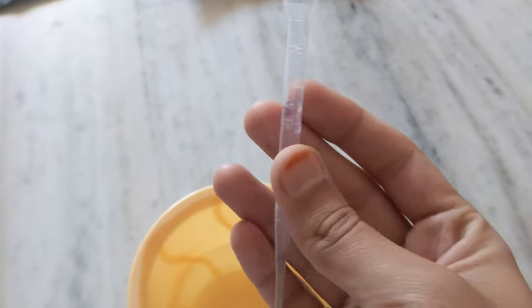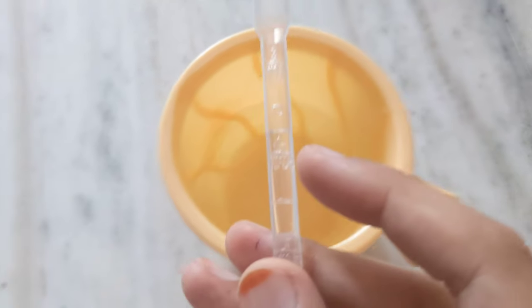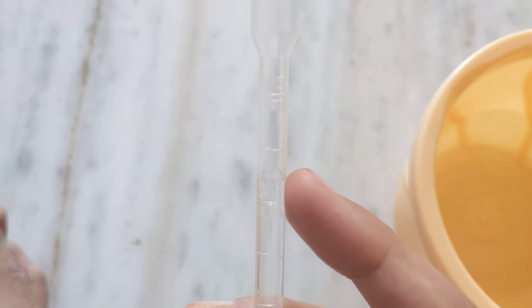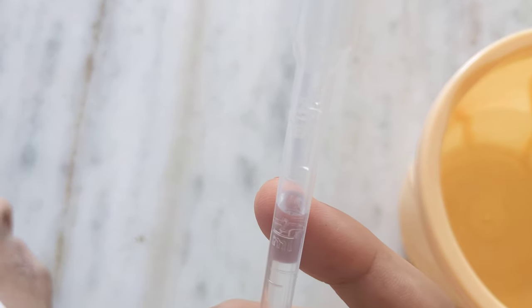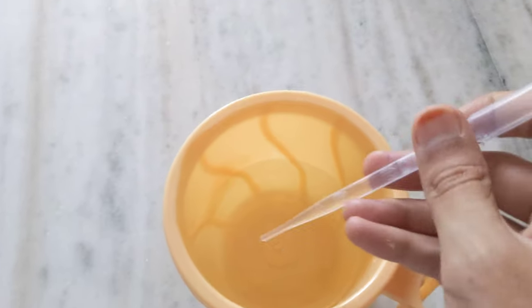Now let me check how much water is in this. It's getting a bit out of focus, let me try to focus it. This is the 1 ml mark and this is the 2 ml mark, and the water is slightly above that — so about 2 ml. If I had used a colored liquid it would have been easier to see, but you can see the water is just above the 2 ml mark.